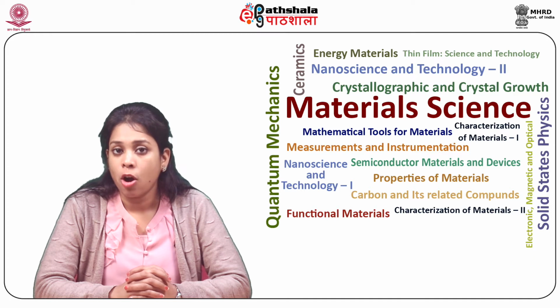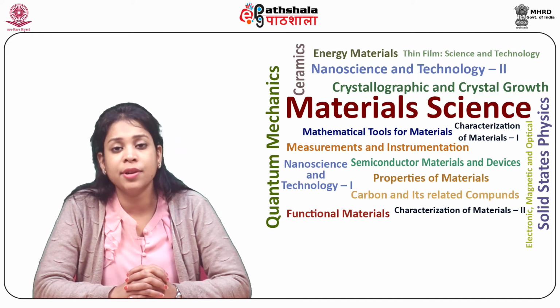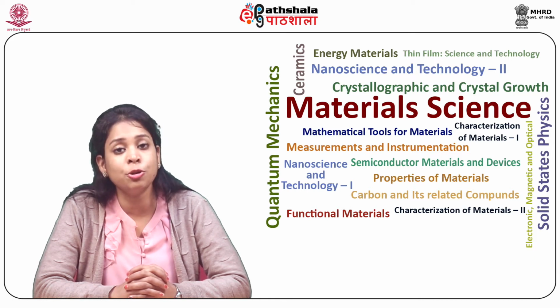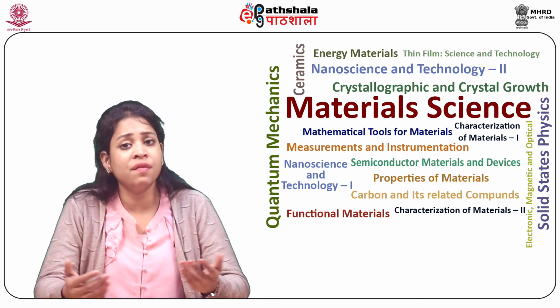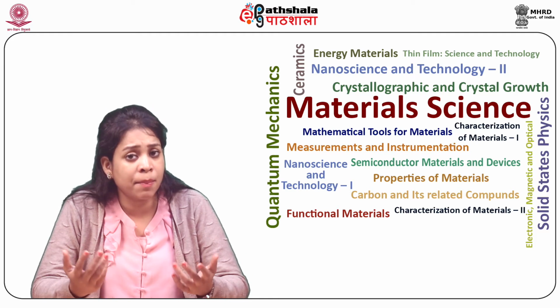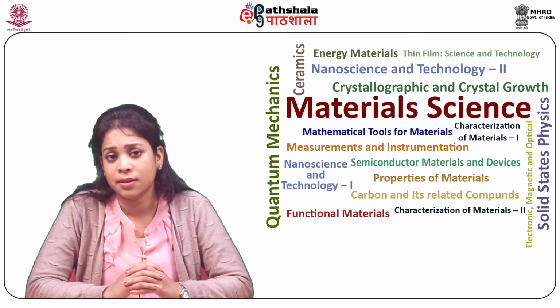NQR is performed in solid state materials, whereas high resolution NMR involves liquid or solution state materials. As a result, the averaging effects as observed in high resolution NMR are not present in NQR experiments.